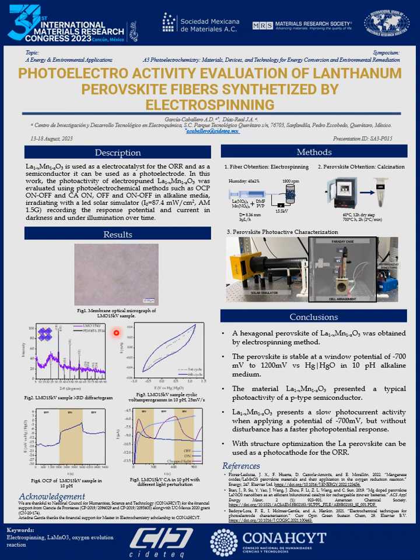We first can see a micrograph taken with an optical microscope where we can observe the threads formed by the syringe during the electrospinning process. In order to prove that we obtained the perovskite structure, here is a diffractogram of the powder that we obtained. And from here we can say that we have a hexagonal perovskite with the stoichiometry that is written in the conclusions.